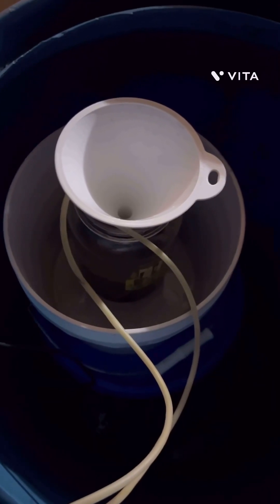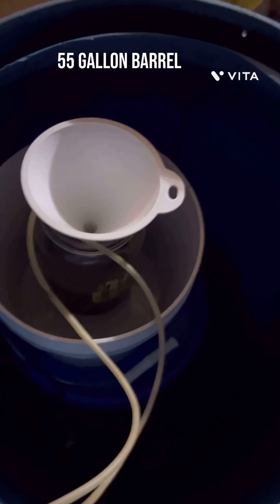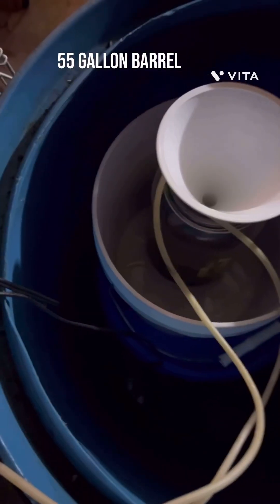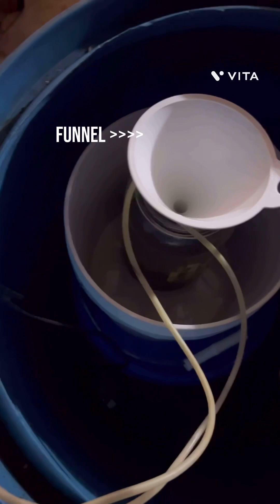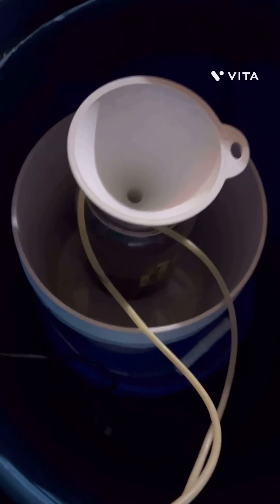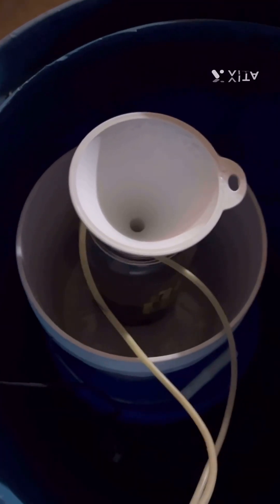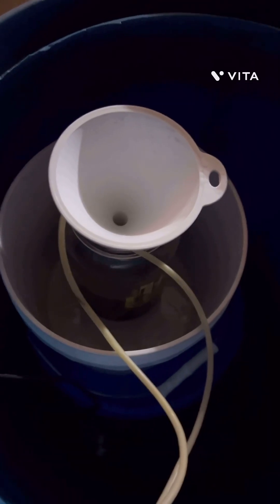So here we are outside. My AP container is a 55-gallon bucket — that's where I usually run the chips through, this blue one. There's a white bucket I use for the overflow when I put the pump funnel in to help keep any splashing down and hopefully just falls back in. We'll see how it works, but I'm gonna put the lid on it, start the bubbler up, and we're gonna call it a night.